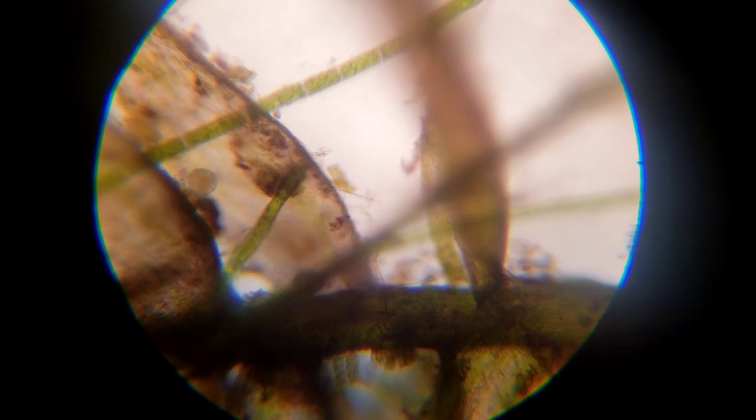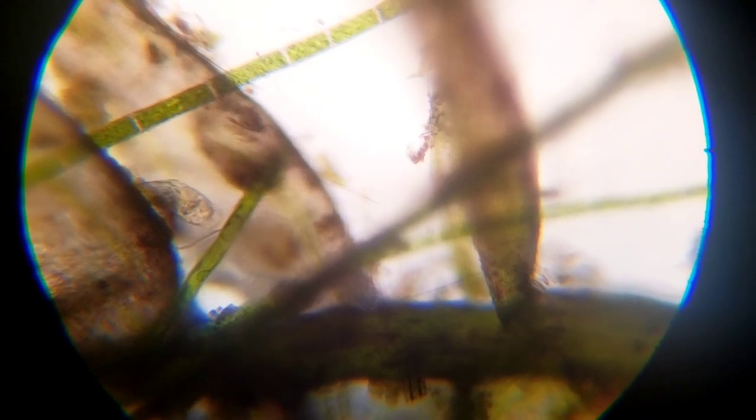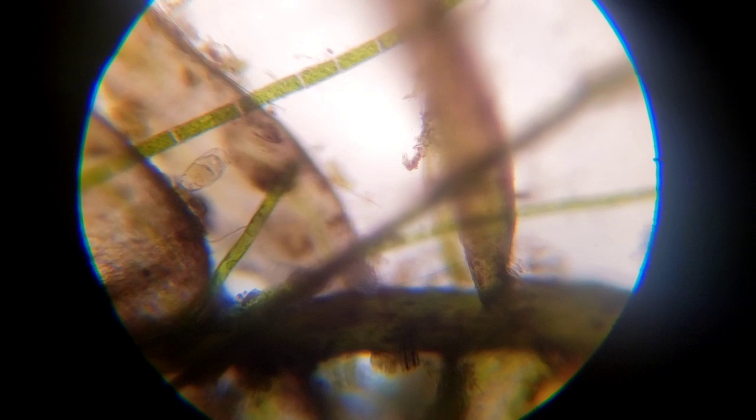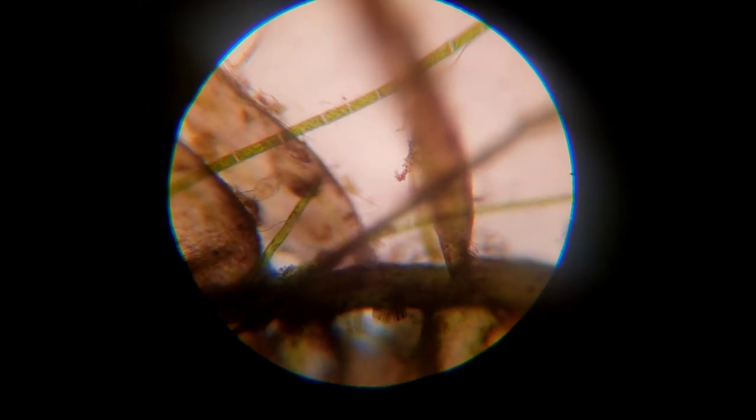Hopefully — and I can tell already just by this one slide here — that we're going to be able to see algae. That's the square block type cells you see here. The green blocks are actually each one a cell, and it has a cell wall, which makes it closer to like a plant cell. It also has chlorophyll in it — the green. So plant cells and algae cells look like that. The algae cells tend to usually look like little bars, and that's what we're seeing there: filamentous hair algae.